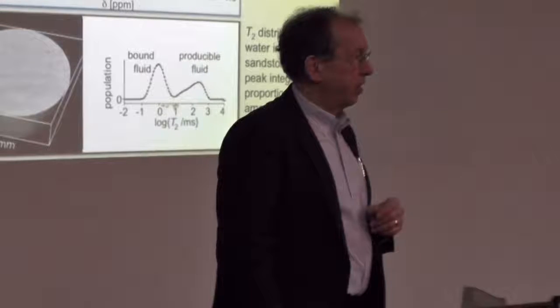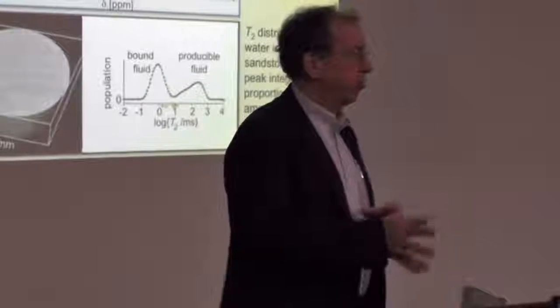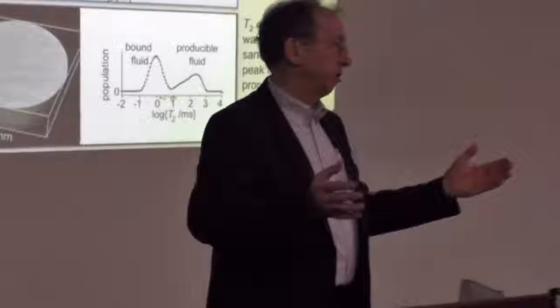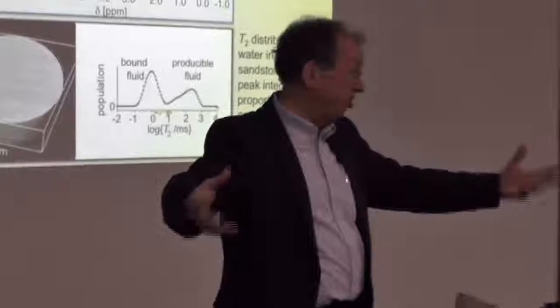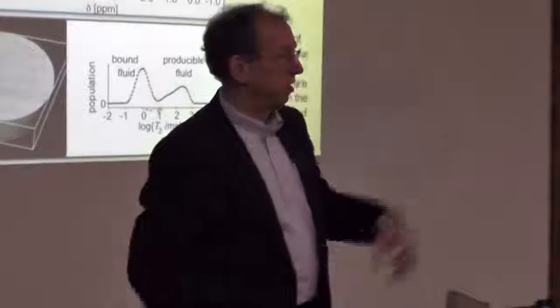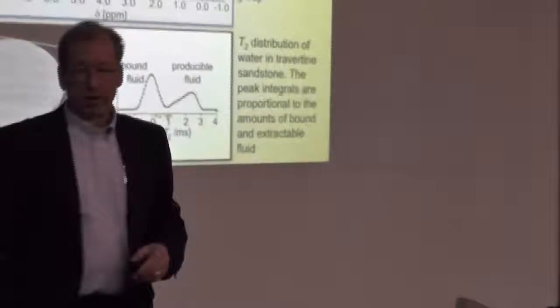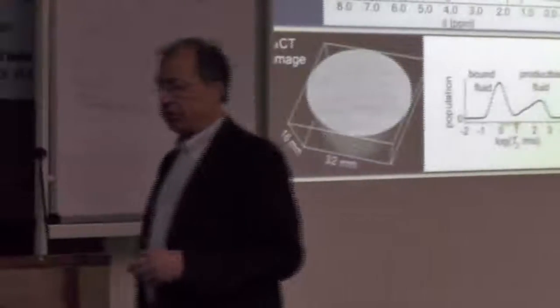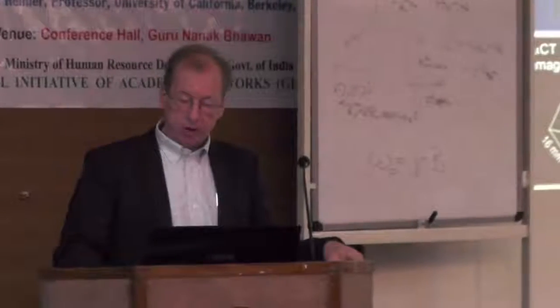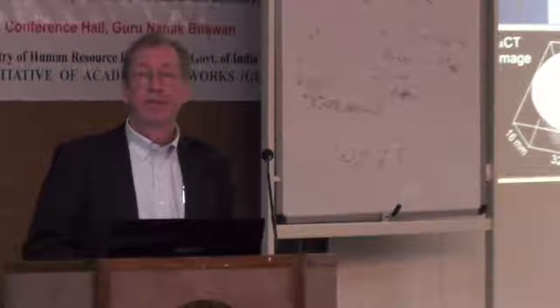And for that, they can work with them. Small molecules can work with these machines, but typically one uses the big machines for sensitivity and chemical shift dispersion. The chemists do, the physicists don't. Other questions?